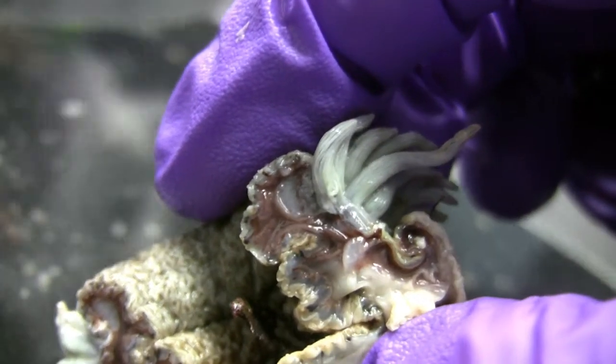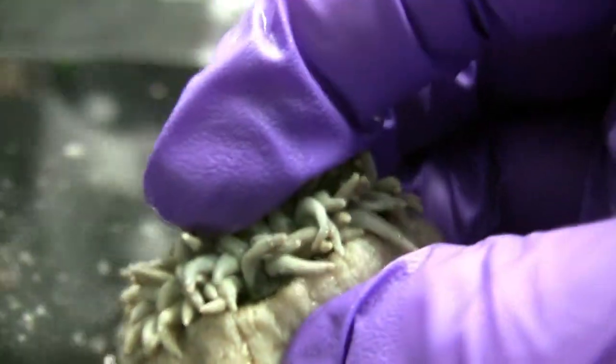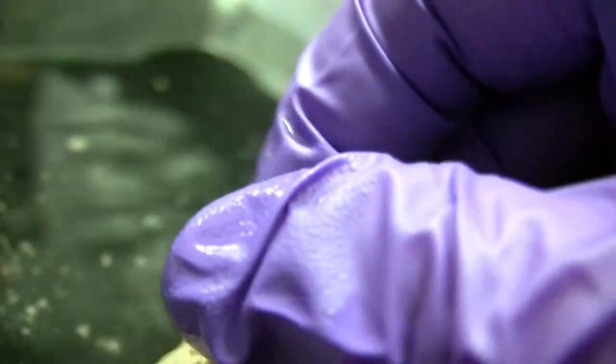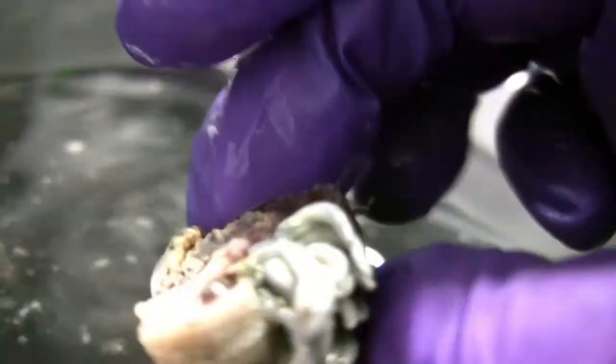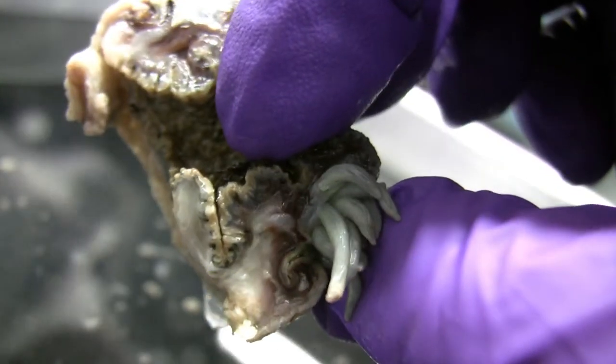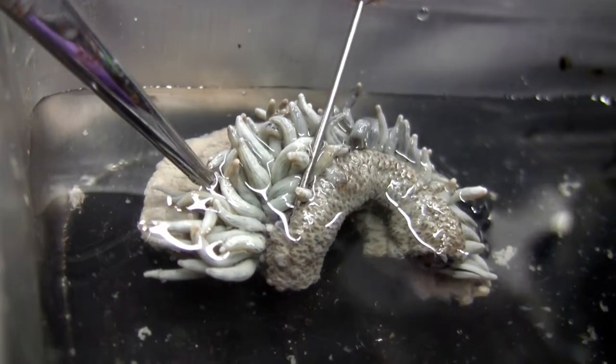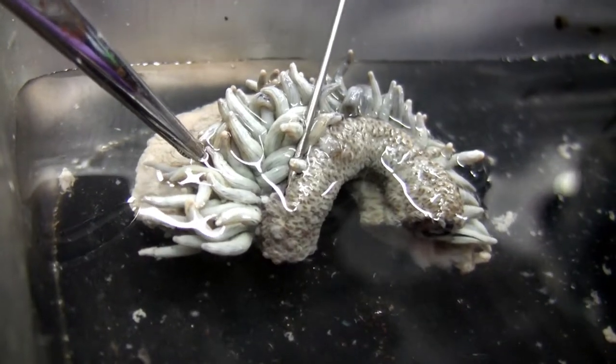Now if we look at this, can we find acrorhagi? Or do they only come out like this? They only extend when they're, like, fighting — they have to be extended. I know at the reef we come in and we see some of the anemones are, like, pissed at each other. I don't think we're going to see them because they have to be averted by the anemone. Wait — there they are. The gonads. You see the little white dots in there that are, like, way underneath the base? Those are the acrorhagi. We found it!